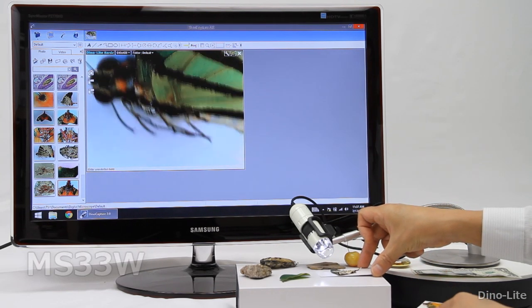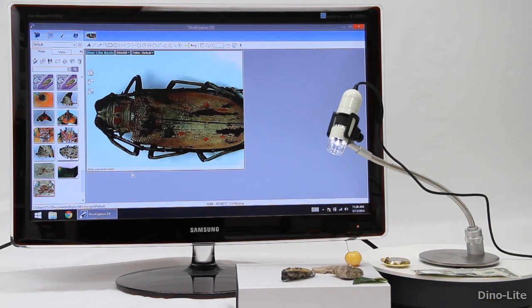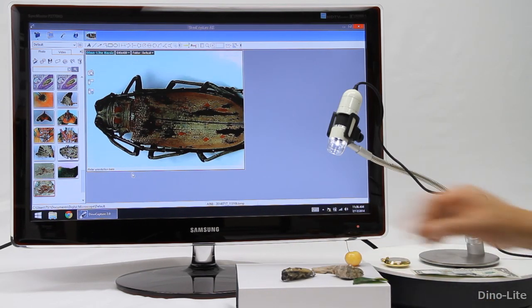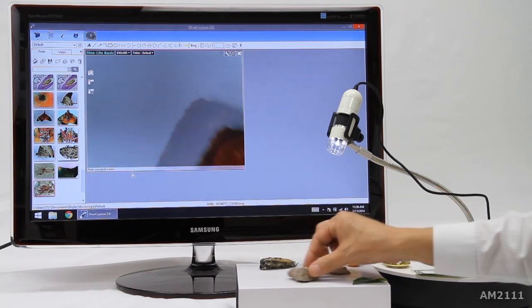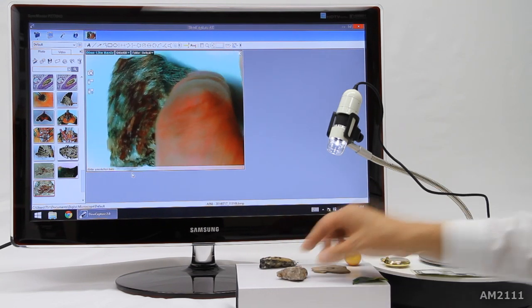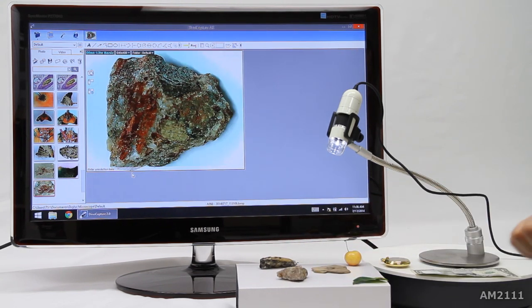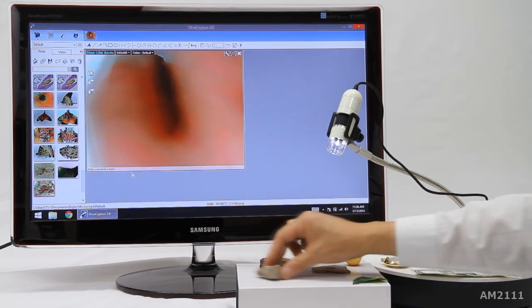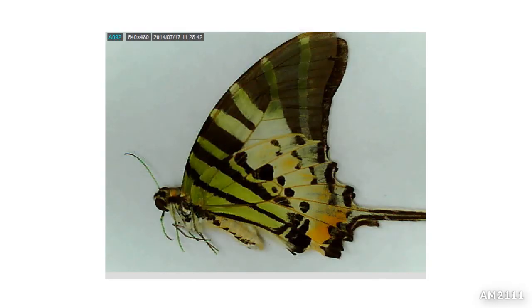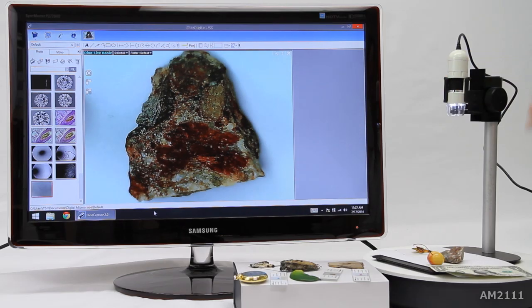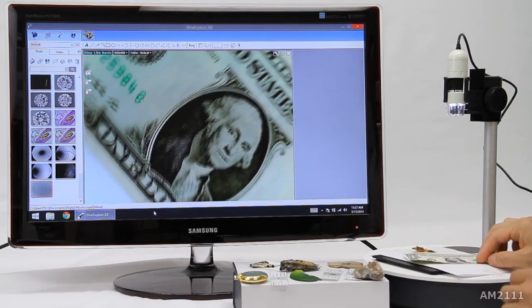The AM2111 is very easy to use and while this is the basic model, still offers DynoLite build quality and software, making it a very popular choice for schools, students, museums, hobbyists, and much more.